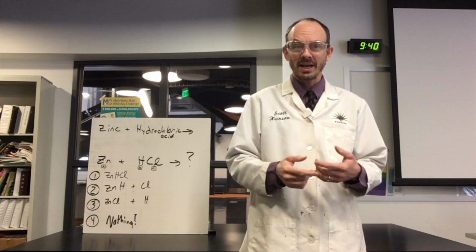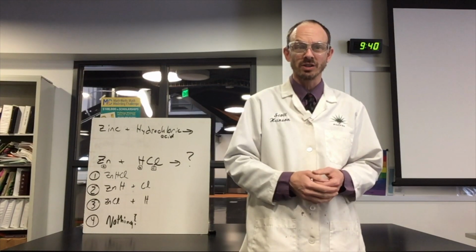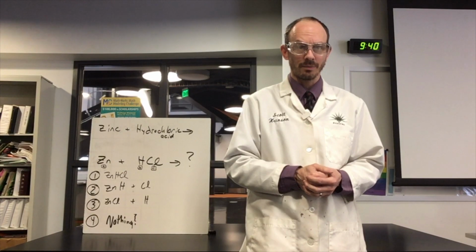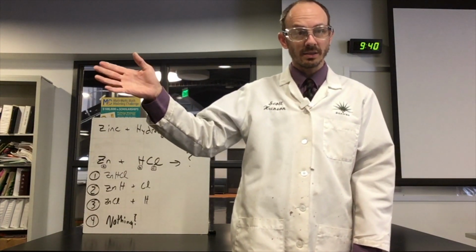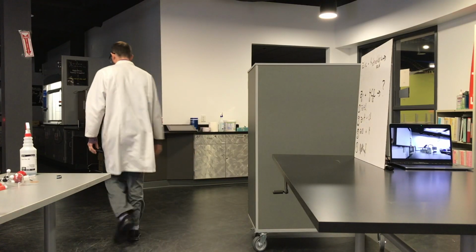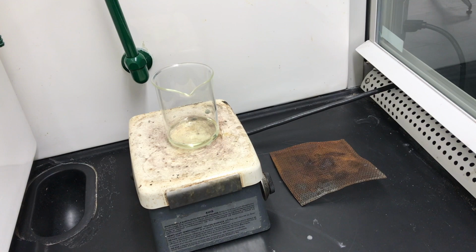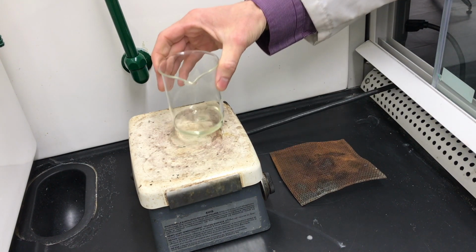In order to have that mass, we're going to do it like we did on some of the other ones, which is mass by subtraction. That means we need the mass of the beaker that's inside of there. Well, here's what we're going to do. Since that beaker, right now, we don't have a mass of. In fact, I don't want to get this rolling. I want to take this with me.